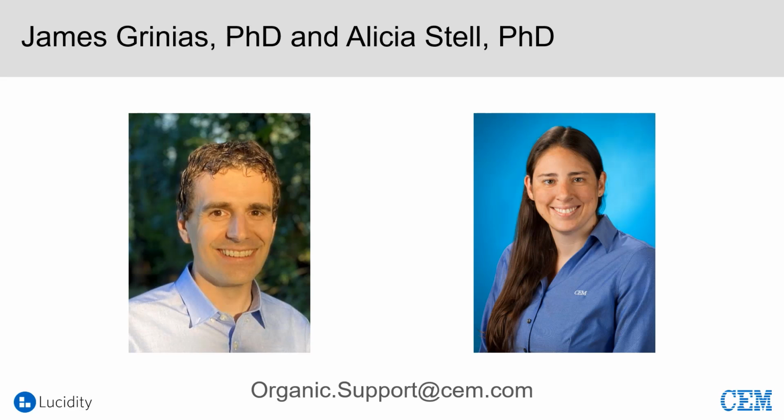I think Jim actually had an article not too long ago where he talked about point of need, point of care analysis, and that really makes that possible. And then also it's green, right? So it's small, it's only one standard plug, it's not using as much energy. Last week, Nick Snow talked about some of that as far as that small size opens up the ability that it is greener, and that is very applicable in today's world as well.